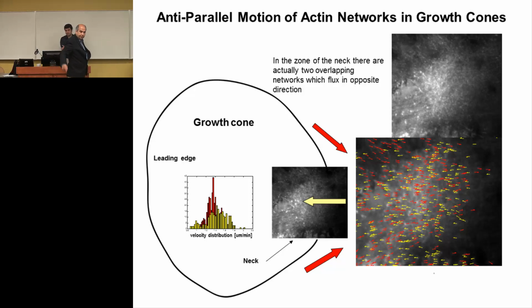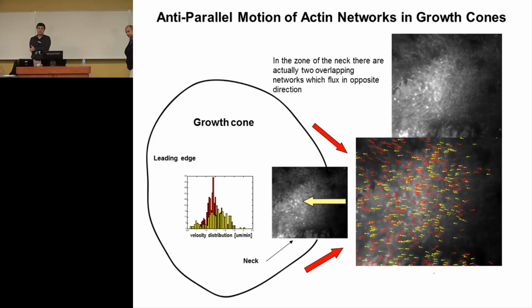Okay. So in the case that you have rotation or a source or sink of the motion, how can your algorithm handle them? Because you run your algorithm, then you do recursive runs to get the direction. If they're moving, you need to do alignment of the images. You need to align them and then detect and track. So you need to correct for the motion of the structure.